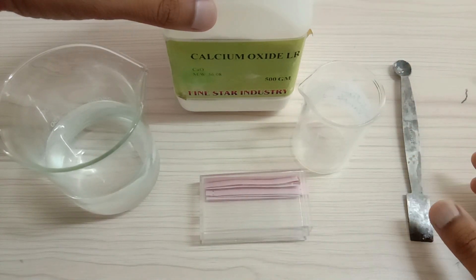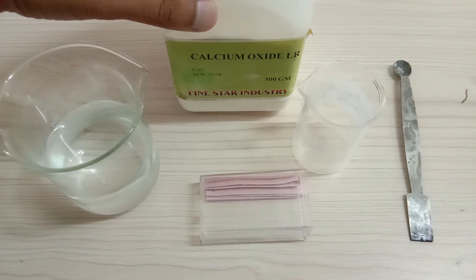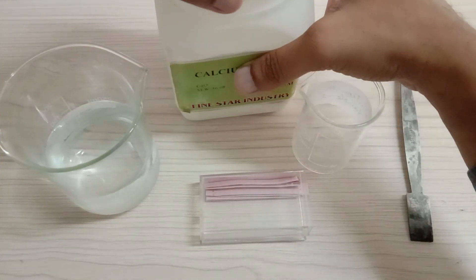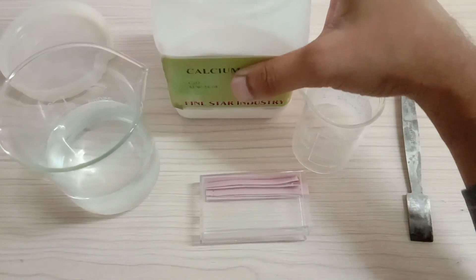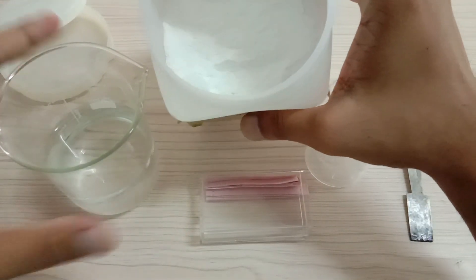This is a small beaker in which I am going to perform the experiment. So now, this calcium oxide is a white color powder. Let me show it to you, it's a white color powder, right.